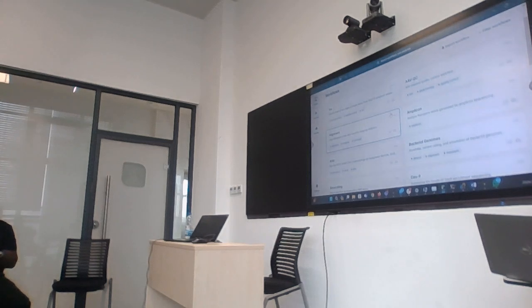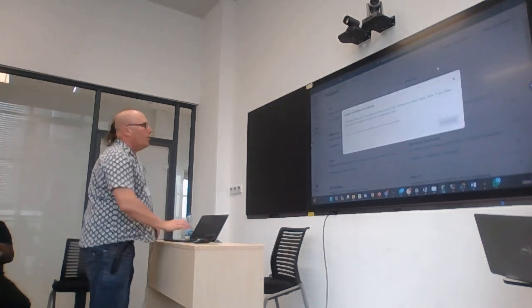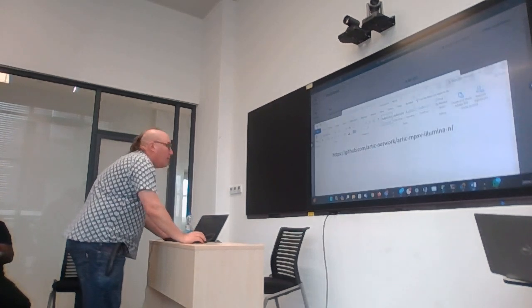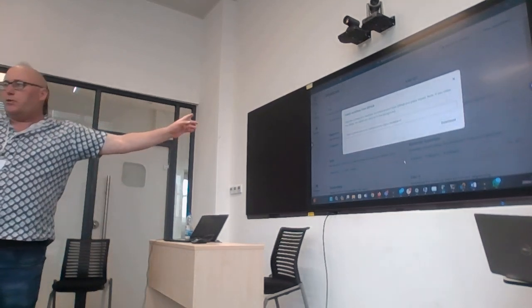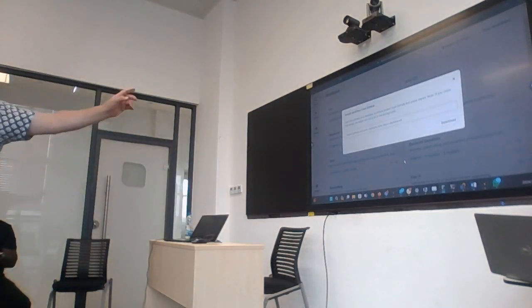Is everybody following me and seeing this screen? For you guys, it will look a little bit different, okay? Now, the thing that you want to do with the link is import the workflow. So I'm going to go back to my document, and I'm going to copy this and put the whole thing in there. Apparently that's been sent to you on WhatsApp, and it's in the document that has been shared with you. It's a long link, but make sure to get it here.